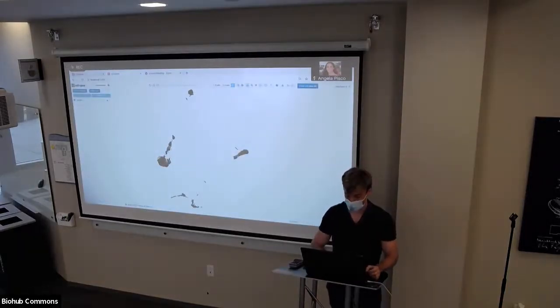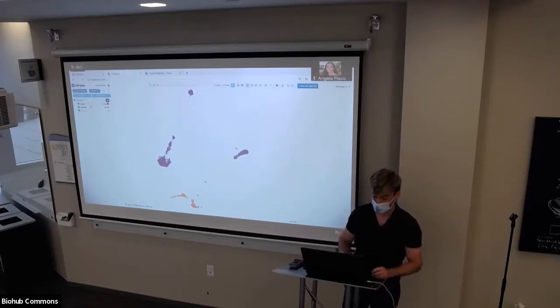So yeah, going through cell by gene's features. What cell by gene came with is the ability to load in any annotations that were in that OBS slot of the AnnData I showed you. The OBS slot attribute contains all the cell metadata. The only metadata here is this annotation vector called orig ident. This is automatically loaded by my cell by gene at runtime to indicate that there were multiple batches loaded. Here, the name of the batch corresponds to its file name. So there was one file named PBMC3K and one named PBMC500. You can click this droplet here, and it colors the scatter plot based on these annotations. So now you can see which cells are coming from which batch.